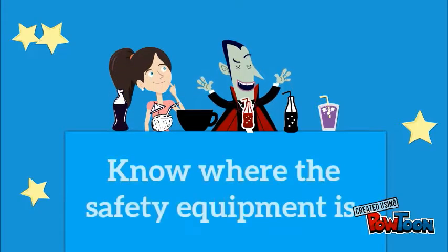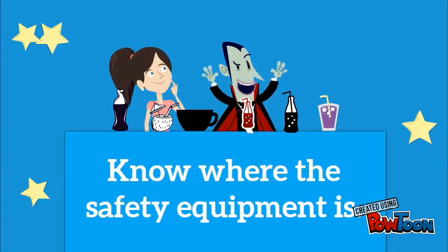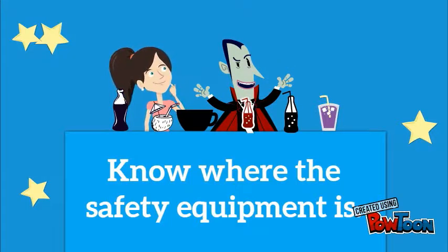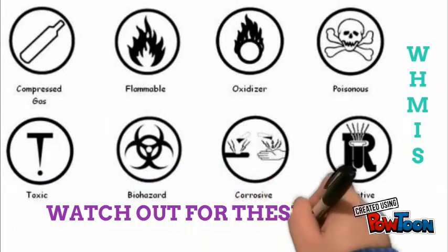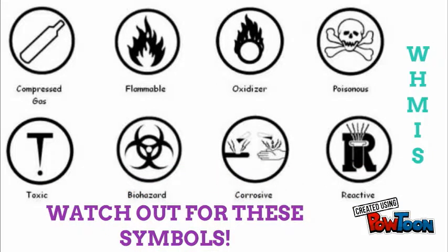Make sure you know where all the safety equipment is, because usually when the teacher leaves the room, that's when the most fooling around happens. You should be able to protect yourself in case something happens. Watch out for these symbols, as they are safety hazards and should be taken care of accordingly.